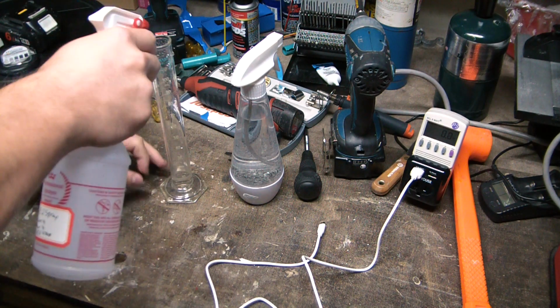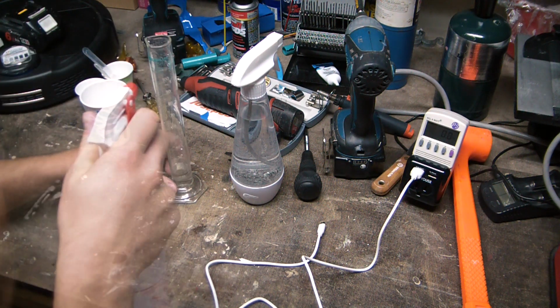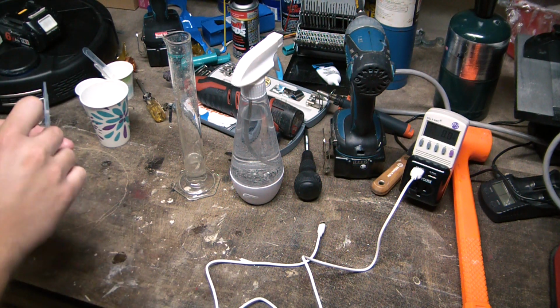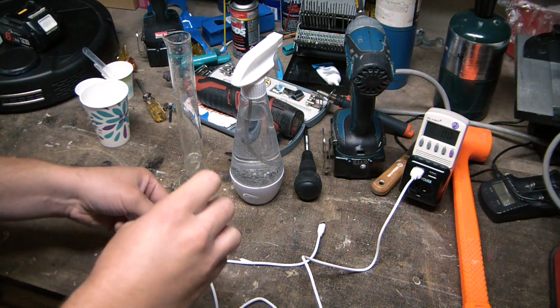So let's level that up to 20 with some DI water and then we'll test it. Give it a little swirl. We'll just use a drop so we don't alter the concentration too much. I have a feeling we might be doing this a couple times.